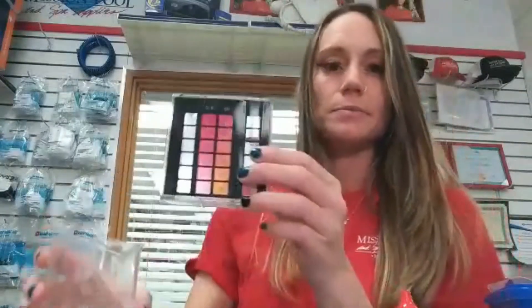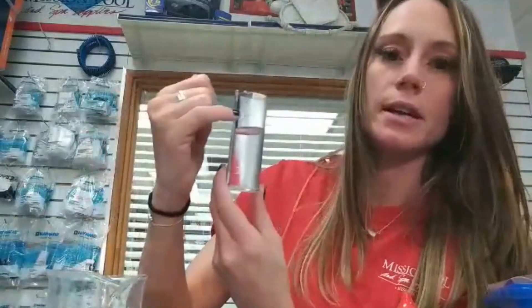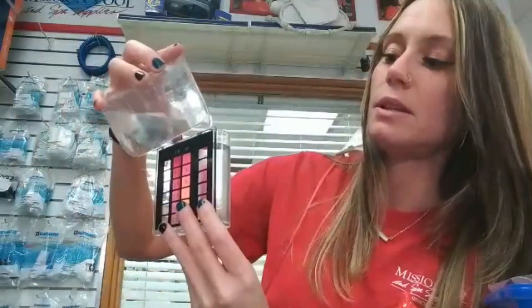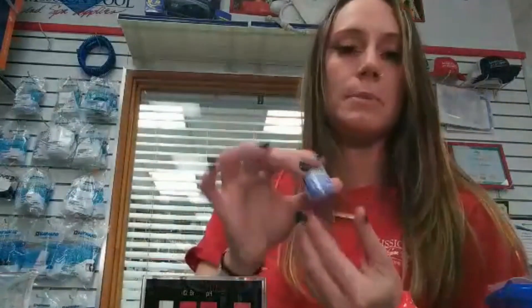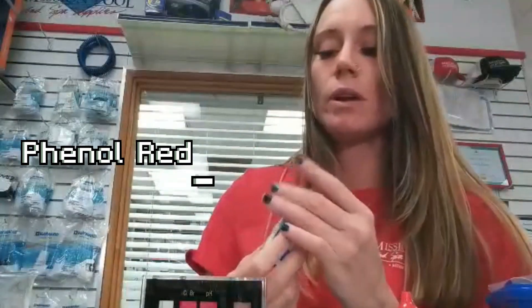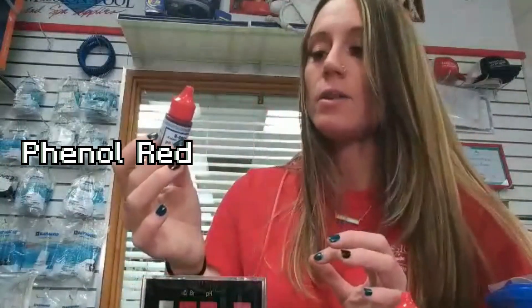I realize everything is backwards. We're going to take our testing decanter — the one on the right says pH and it is the larger one. Turn it to the side and you'll see there's a little line there. Go ahead and fill it up to the line, not too much, not too little — we want exact measurements. Then we're going to take our Taylor test pH indicator, which is number four. It's really important when you're testing that you get even-sized drops, and the bottles are actually designed to accommodate that need.